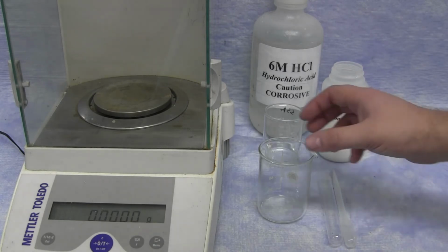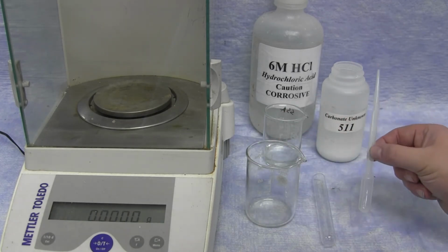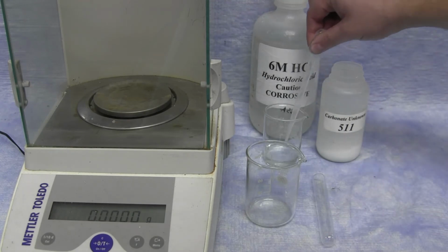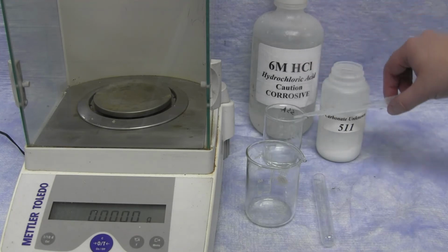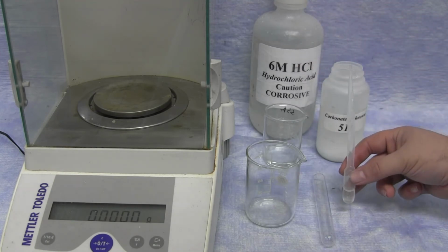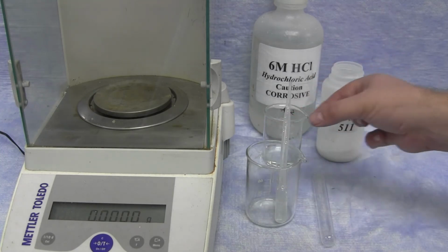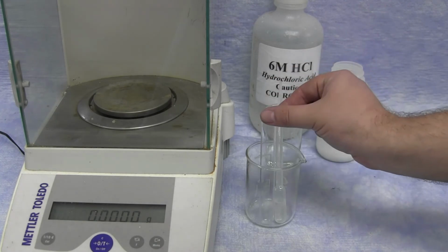First, you'll obtain an empty beaker, an empty test tube, and an empty pipette. In the pipette, you'll use 1 squeezeful of 6 molar hydrochloric acid. This pipette then is placed in the empty beaker along with an empty test tube.